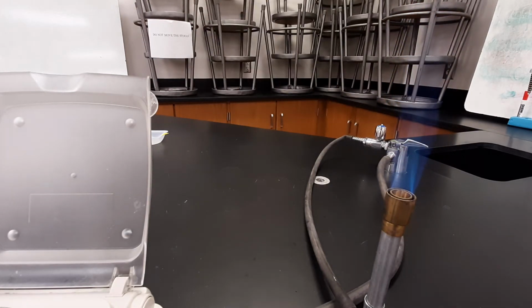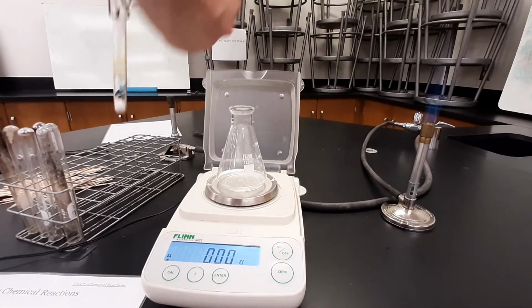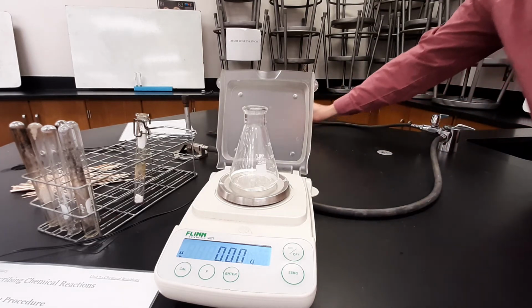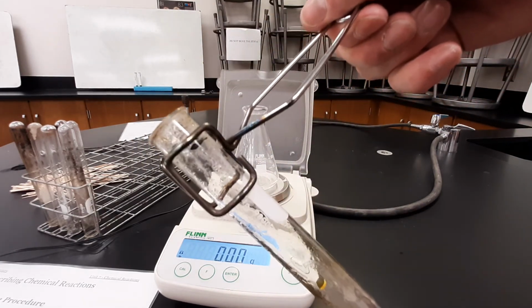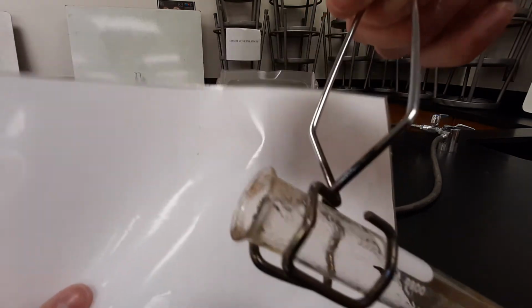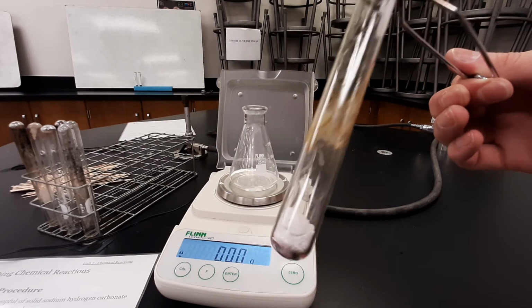At this point, I'm going to remove the test tube from the flame, and I'm going to place the test tube in my test tube rack to cool. One thing that I can notice about this reaction is up at the top, there's still going to be some liquid. Maybe if I put this behind it, you might be able to see, yeah, there's liquid up at the top. And at the bottom of the test tube, we still have our white powder. But the powder doesn't seem to be moving around as much as it did at the beginning.